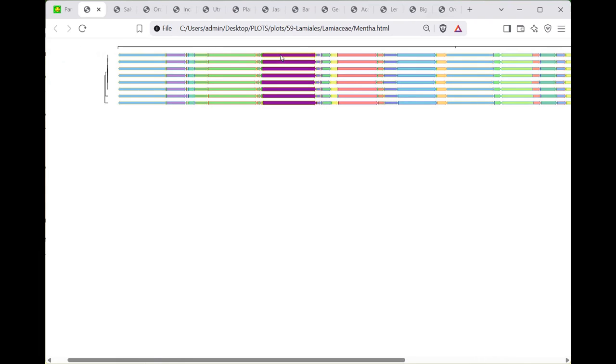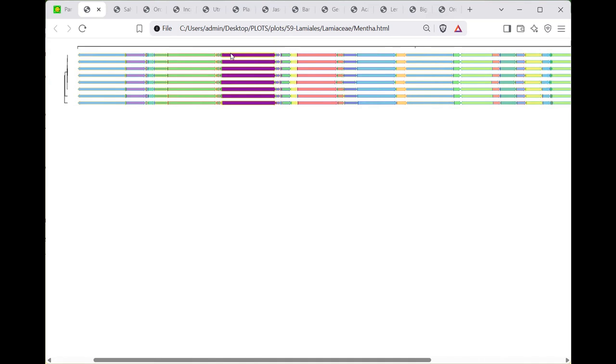Let me show you. So I clicked here and you can see that the entire group of sequences are highlighted. One thing I did before making these plots is to align those sequences in a way so that the identical blocks are all on top of each other. But in general, this feature is quite helpful when these sequences are not nicely aligned. You may see a conserved block which is here in the first sequence, but here in the second sequence. Remember, the plastids are all circular. So even if I move these and do a circular rotation, they will still be the same plastid sequence.